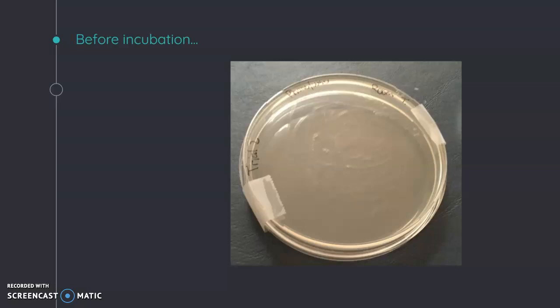Bacteria utilize the nutrients in the agar for metabolic processes, which lead to growth. We incubate the bacteria to increase the rate of growth. Bacteria will grow at room temperature, but we typically see accelerated growth when bacteria are incubated at body temperature, which is approximately 37 degrees Celsius. This is not true of all bacteria, but will be the rule of thumb for bacteria that we grow in MI and BI in the years to come.